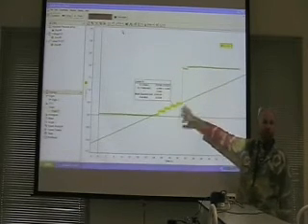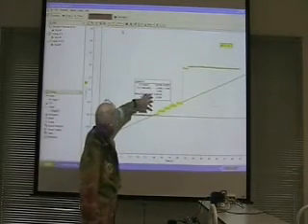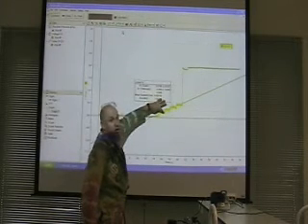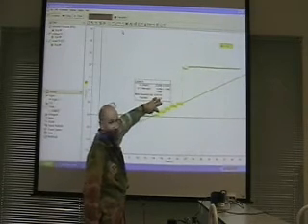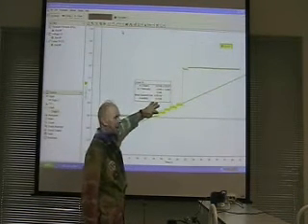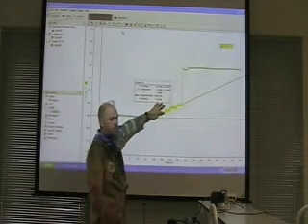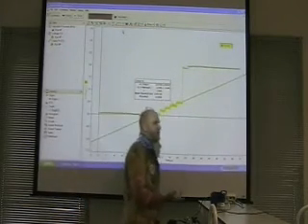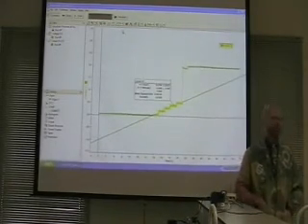Now the reason for the stair steps, it's not the fault of the GLS. It's the fact that the colorimeter takes readings, it took one at about 15, it takes readings every second. Right, so basically the GLS is taking readings that are about 10 per second, and so it's taking that, still with that reading, and then suddenly the colorimeter sends it another number and then it sticks on that. So the stair steps is not because the reaction is doing that, it's because the colorimeter is only sending that information once every second.